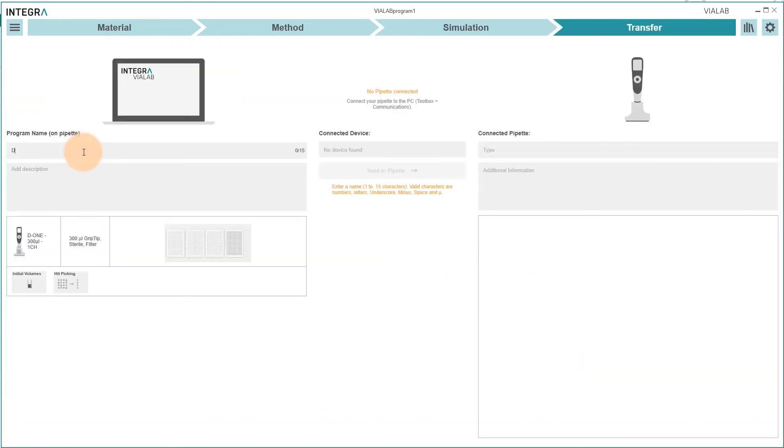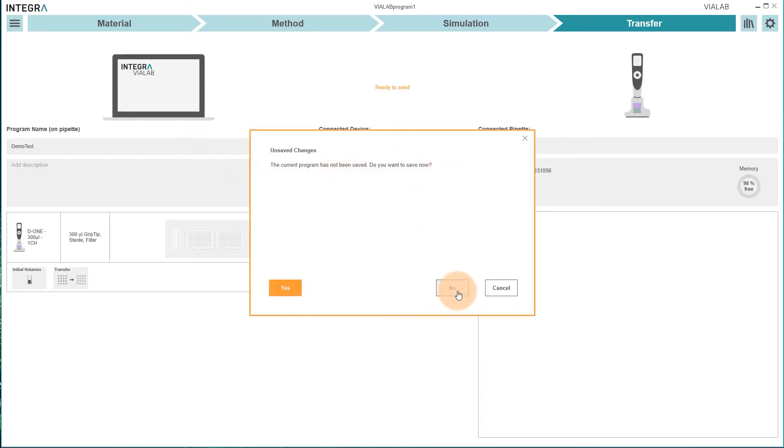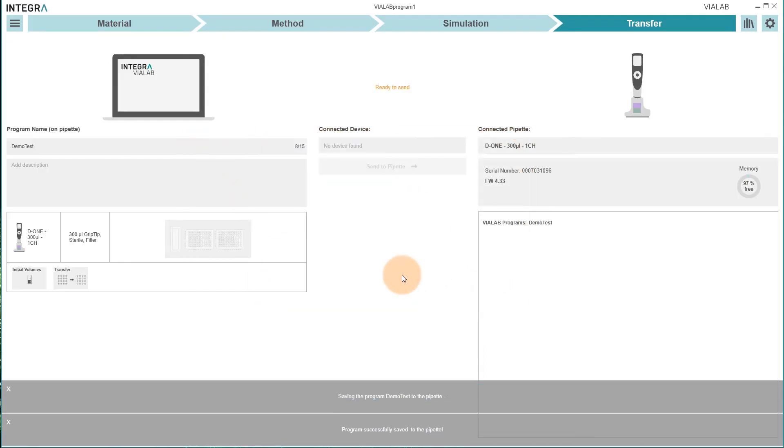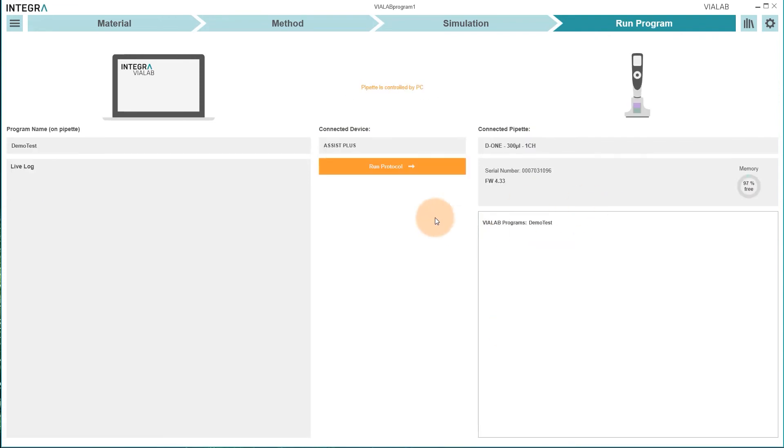Finally name the program and either transfer it to the Pipette or start it directly from Violab. Now your program is ready to run on the Assist Plus.